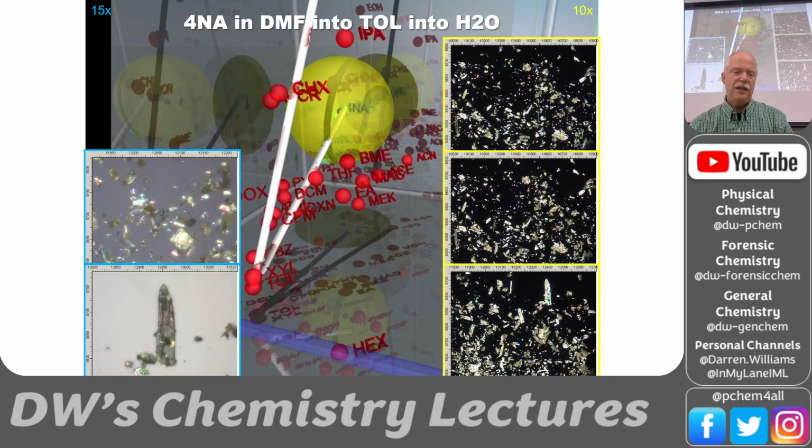Okay, and then we see this one, it's almost a picker, not quite, but we see this one large crystal here. And remember, when we had a polar solvent, we were getting these needles, okay? And toluene's not polar at all. So how is it that we got this one needle? I did this particular one, and that needle grew on the side of the beaker. So the side of the beaker is playing a role too.